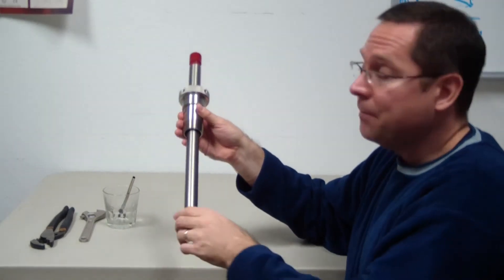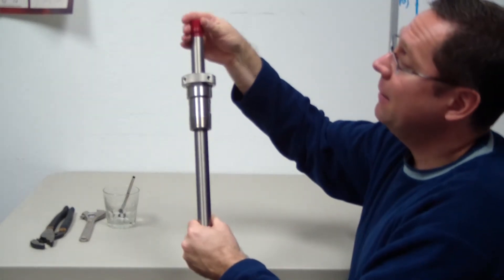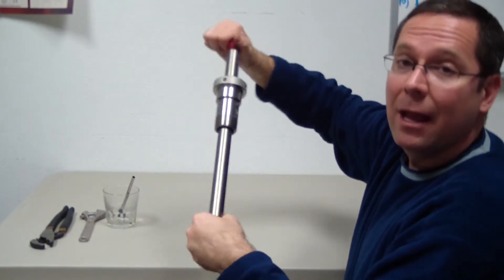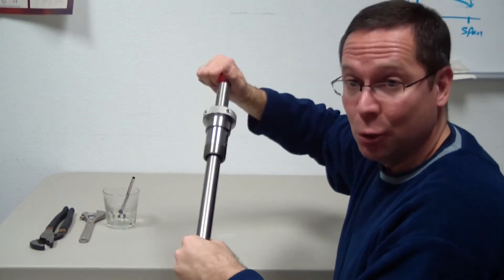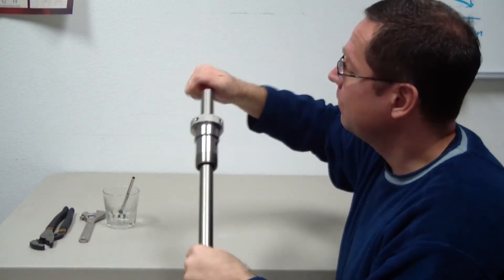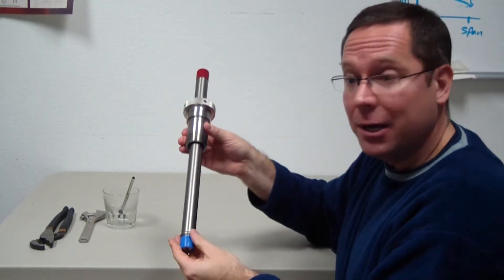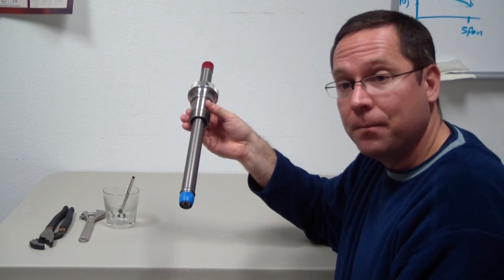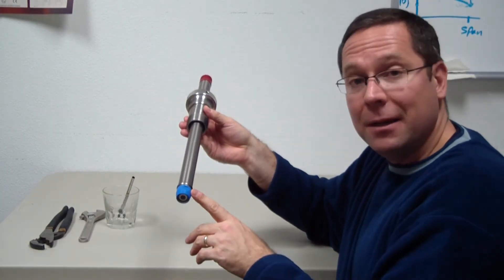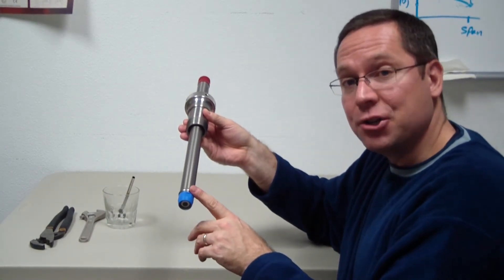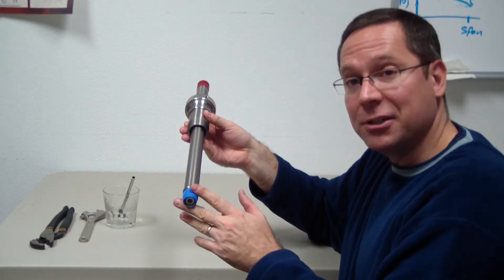As I push the sensor in, it'll push out the back piece a bit, and now I can hand tighten it. No tools are needed. Once I can't turn it anymore, my sensor's assembled. The tip on the sensor will hit against the back of the metallic sheath, and that will withstand your process pressure.